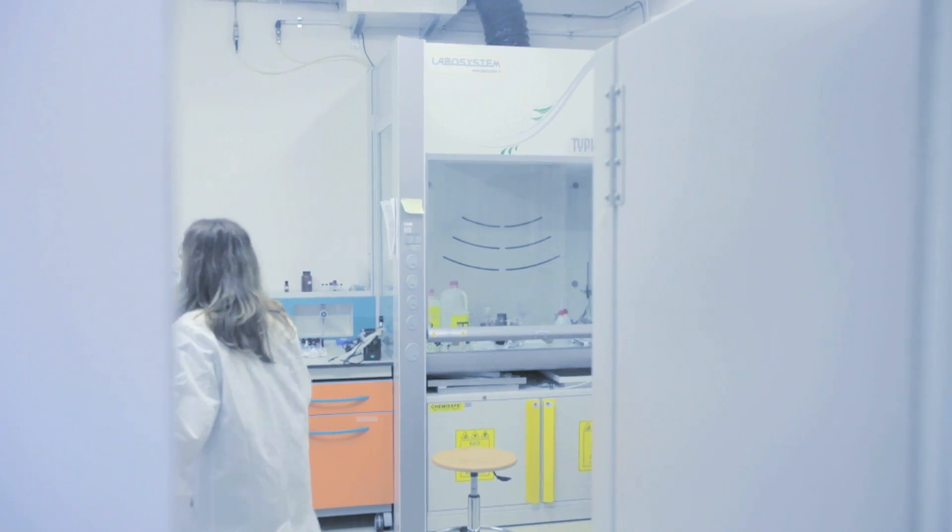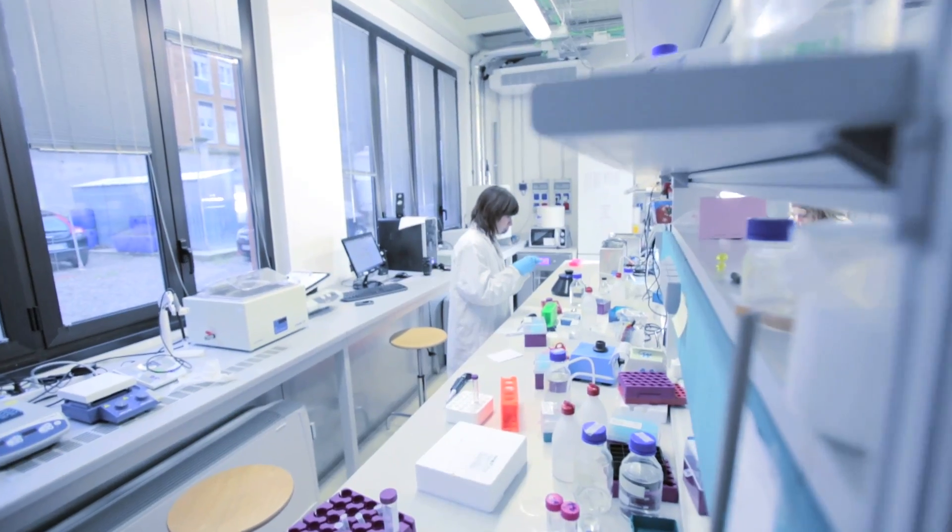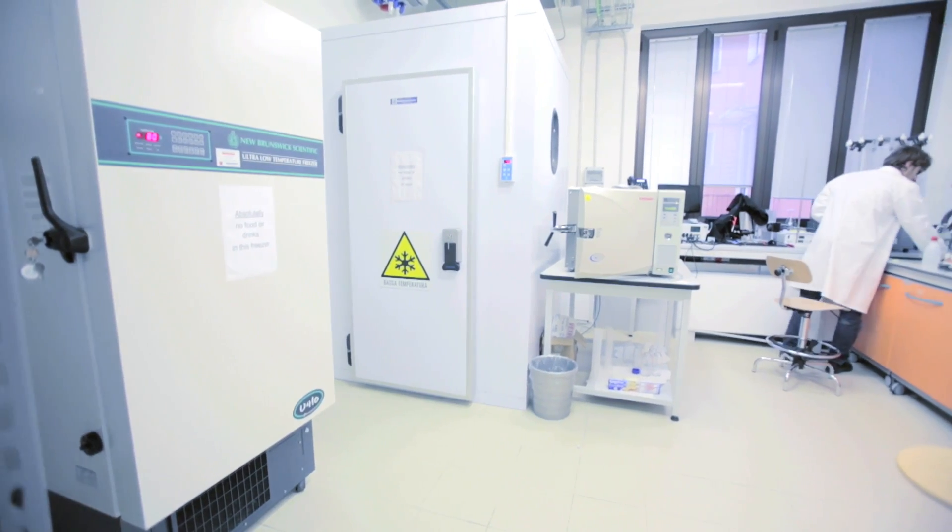Moreover, having available a technique that allows us to easily detect how different parameters can influence the production of protein is very important for us in order to proceed with other experimental procedures.